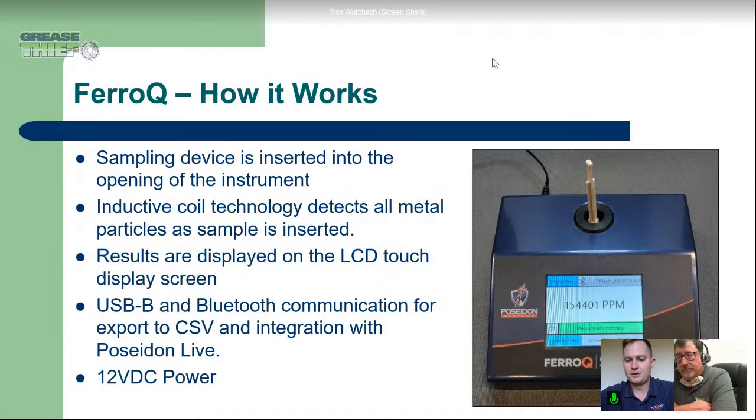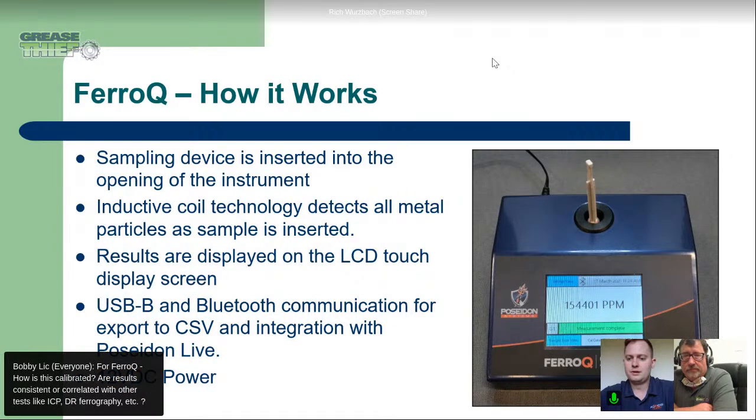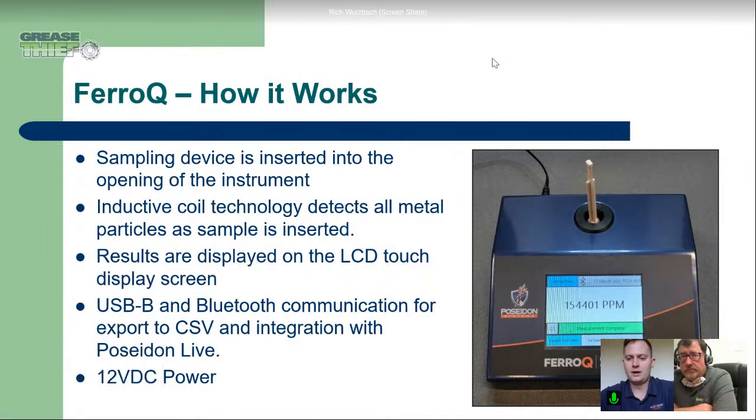So at the end of the day, if you've got 4 different sites or 4 different crews doing maintenance on towers, that's quite a few samples to get through. It can be one after the other, reading out and recorded into the laptop, and then able to work with Poseidon Live.